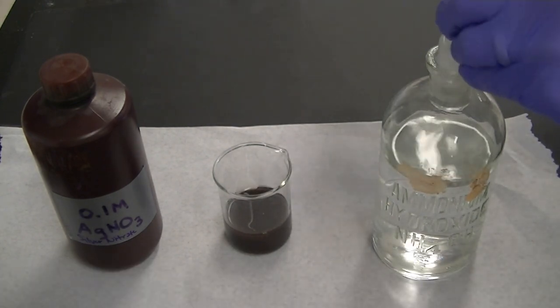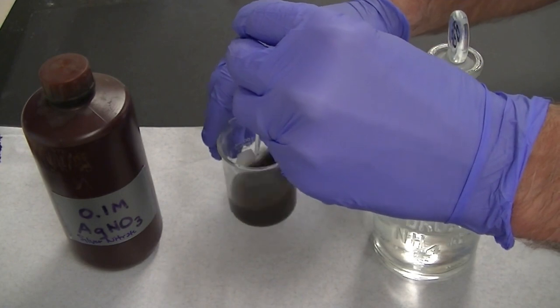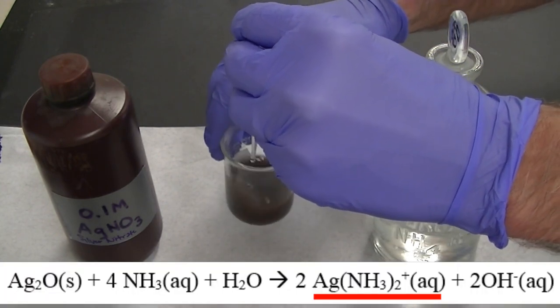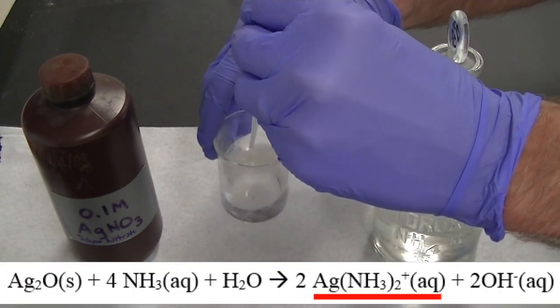Next, I added some concentrated ammonia. This caused the silver oxide to form a silver ammonia complex, which dissolves.